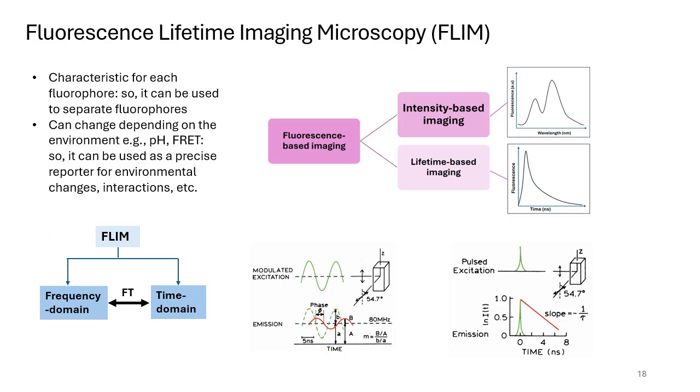Now, fluorescence microscopy is widely used in biological science as well as in material science. But if we only give our concern to intensity based imaging, the emission spectra which is based on the intensity, then it can lead us to some difficulties, as intensity has a great dependence upon the concentration as well as the excitation wavelength.